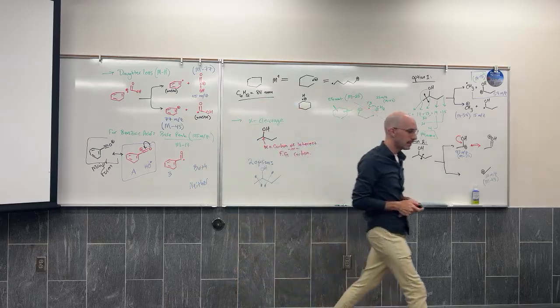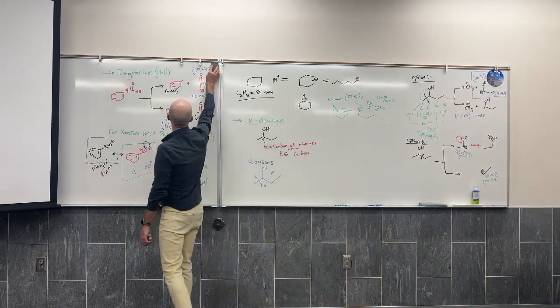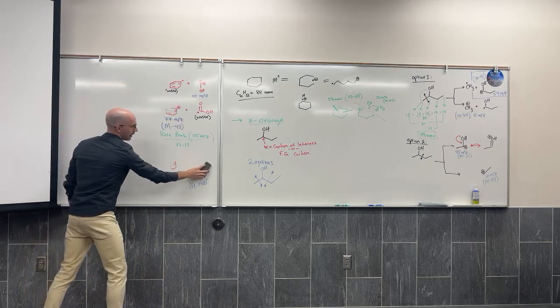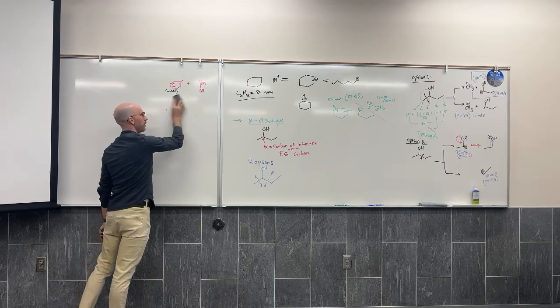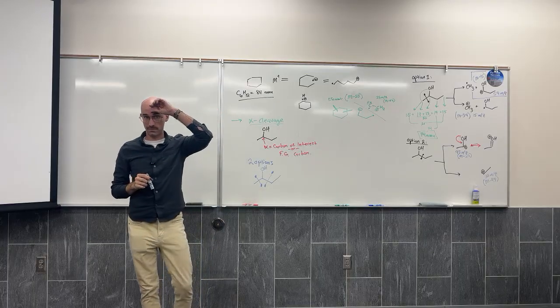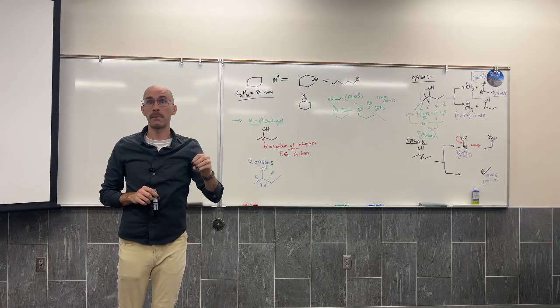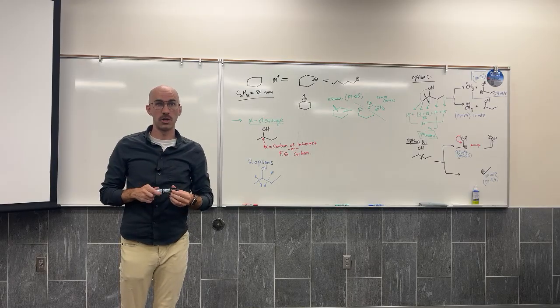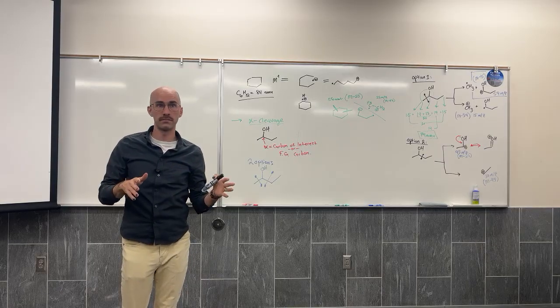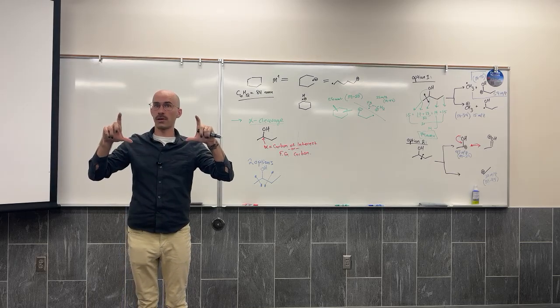All right. The last thing for us to talk about in this realm is isotopic clusters. So at this point, Patrick was asking, I don't need to pull out numbers from thin air, I just look at the periodic table, right? Well, the periodic table does not tell you the mass of an atom. The periodic table tells you the average atomic mass of all atoms. No carbon atom has an atomic mass of 12.01. But that's what you'll see on the periodic table. Carbon, 12.01.